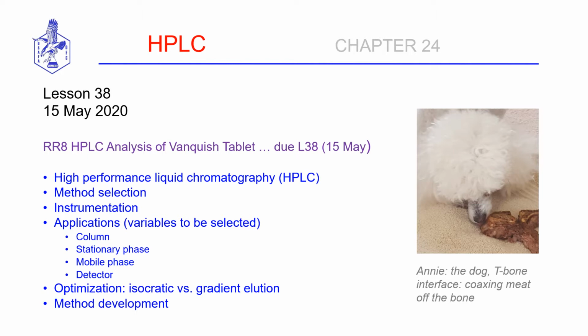So it is primarily in the need to choose mobile phase and the complications therein that makes GC advantageous to LC. But once again, we really can't do gas chromatography on a lot of biomolecules that degrade at high temperatures, so we have no choice. We have to do LC.